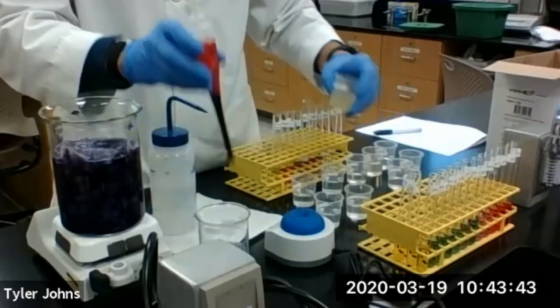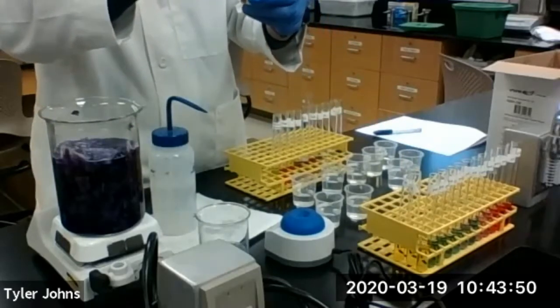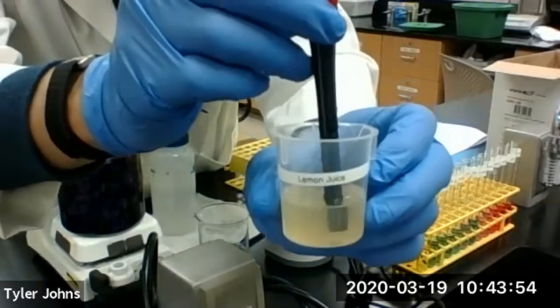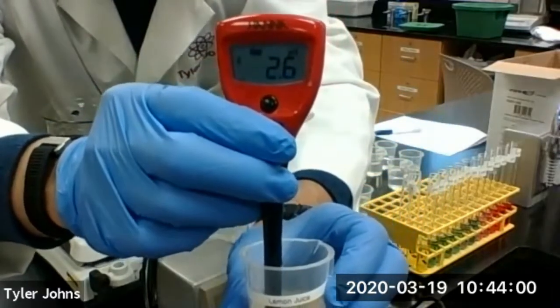Okay, we rinsed our pH probe. We're going to move on to lemon juice now. Okay, so we have our lemon juice here, and here's our pH reading.